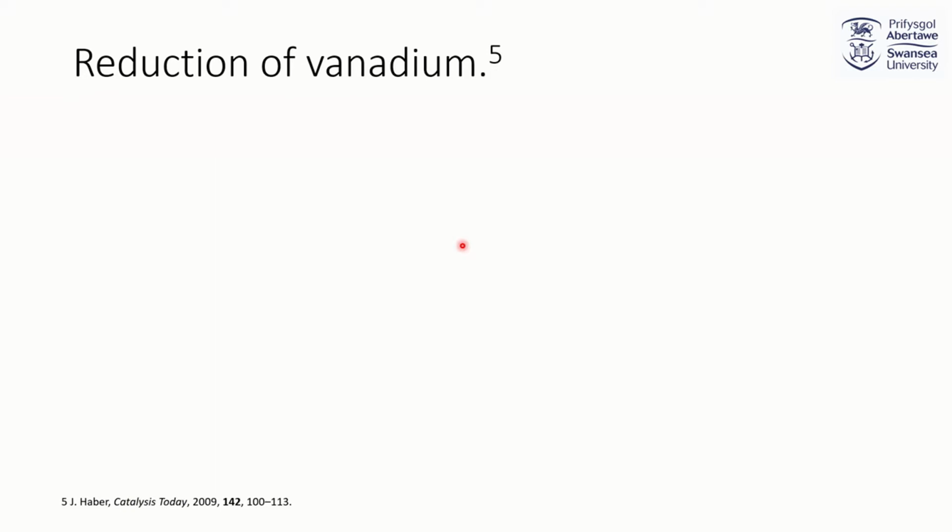In order to do the reduction of vanadium, the vanadium solution should be put into a suitable container such as a conical flask. The peak absorbance wavelength of the yellow solution should then be taken, and then the zinc powder should be added. Once the zinc powder is added, take a sample of the solution, now that the reduction has begun, and put that into a cuvette and into its own UV-vis spectrometer so that the peak absorbance wavelength can be monitored throughout the entire reduction.